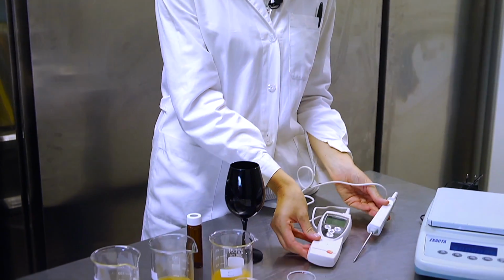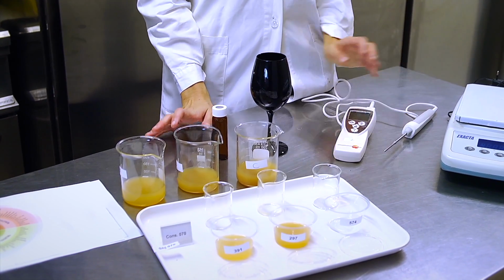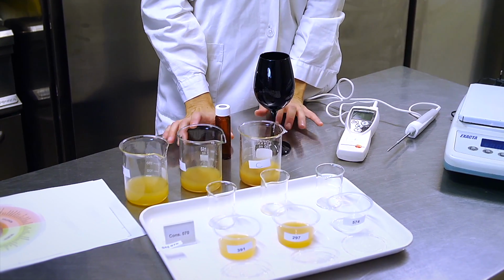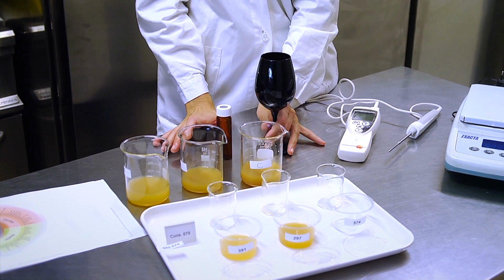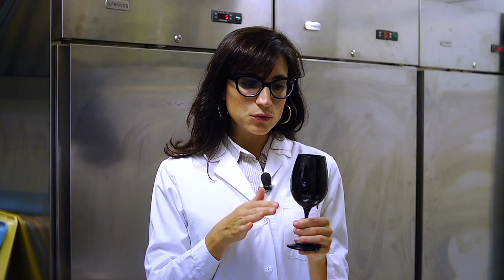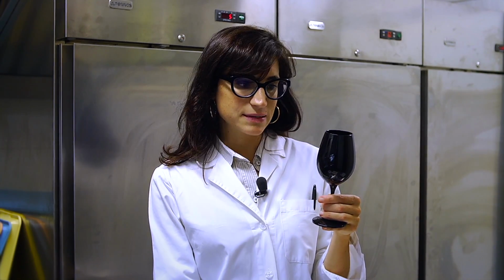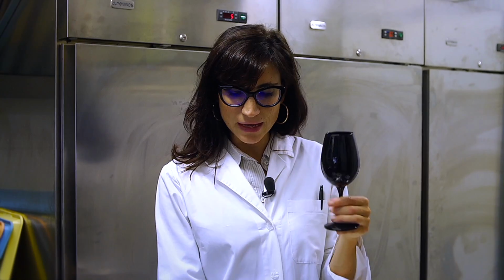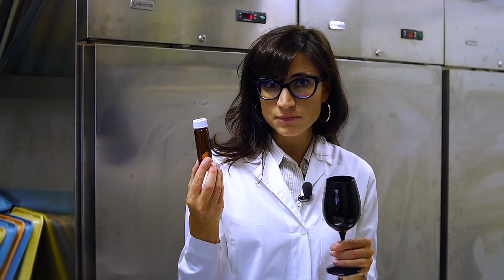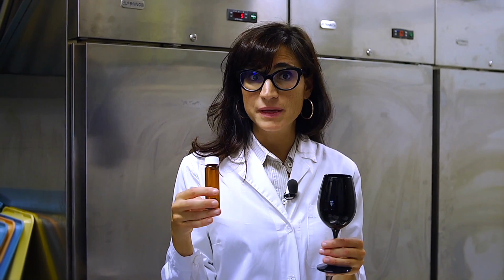In some other cases, we could work on a sample for which we want to exclude the influence of appearance. For example, if we want to just work on aroma without the influence of appearance, we could work by masking the appearance of food. So either using standardized dark-colored glasses like these, or using vials or other types of containers that help in masking the appearance of food.